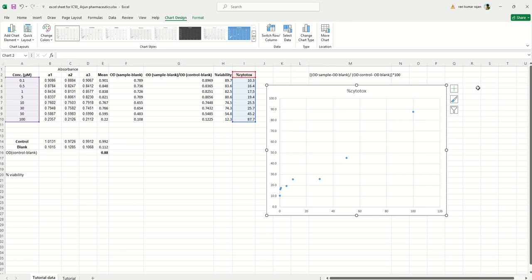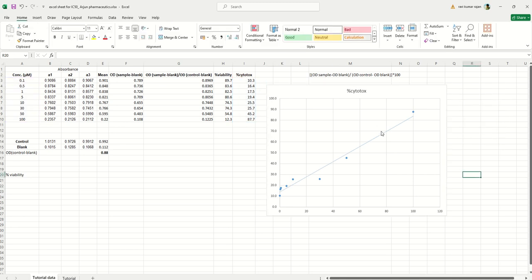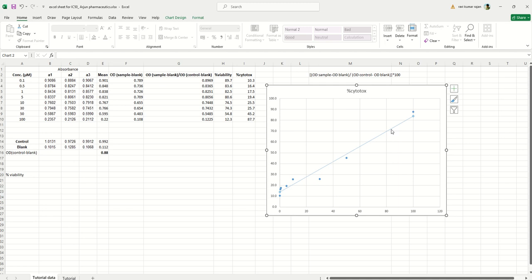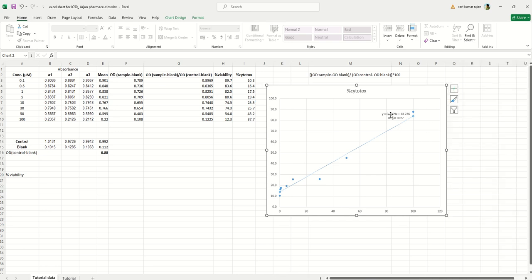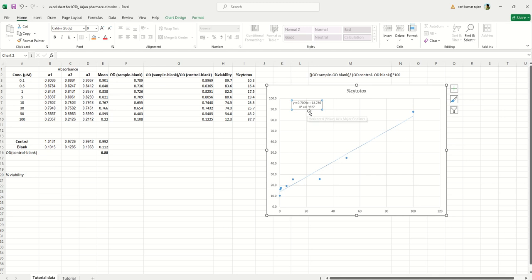Make the scatter plot bigger. Click the plus sign near the chart and add a trendline. Then right-click on the trendline and select 'Format Trendline'. In the format trendline panel, scroll to the bottom and check both 'Display equation on chart' and 'Display R-squared value on chart'. Close the panel. You will now see a box with the equation and R-squared value on the chart.